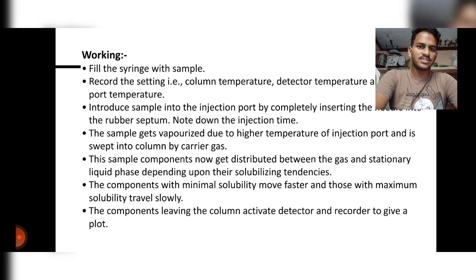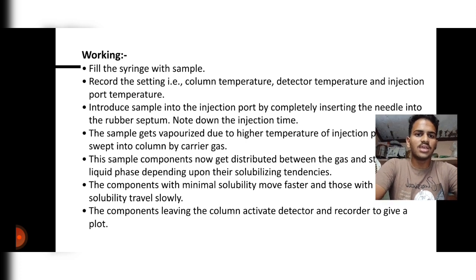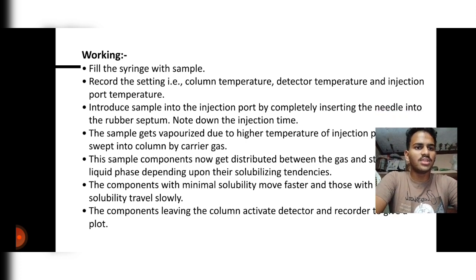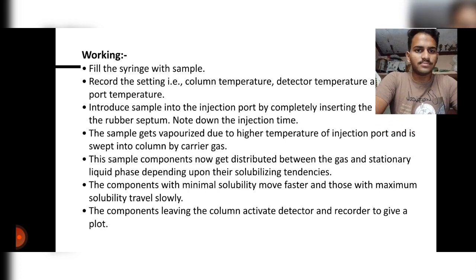Working: fill the syringe with sample, record the settings: column temperature, detector temperature and injection port temperature. Introduce sample into injection port by completely inserting the needle into the rubber septum. Note down the injection time.